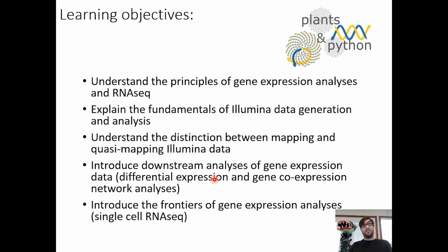Here we've highlighted primarily differential expression and gene co-expression network analyses. Again, I just skimmed the surface here, but you could spend weeks learning about these, and there are other learning resources that you can use. And then finally, just have some idea of where the field is going, and that's in this area of single cell RNA-seq analyses. Hopefully you learned a lot in this lecture.